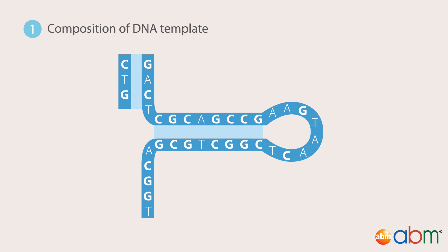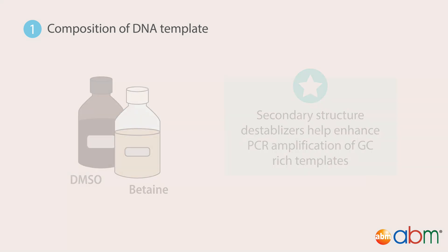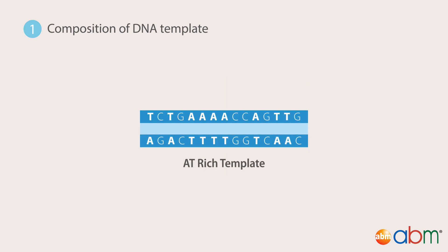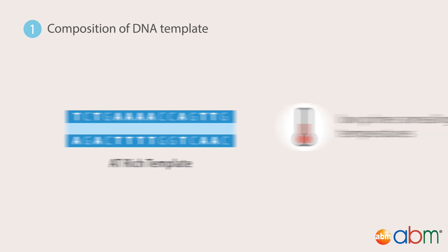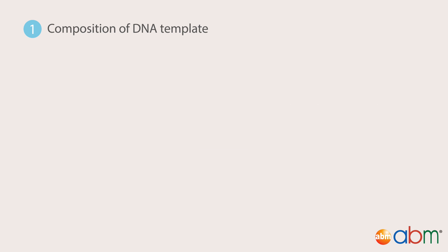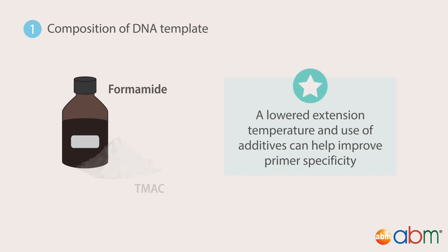In these cases, secondary structure destabilizers such as DMSO can be added. AT-rich templates also require special attention because of their low primer annealing temperatures. Non-specific primer annealing can occur under low annealing temperature, and primer specificity can be retained using a combination of lowered extension temperature and the use of additives such as TMAC.